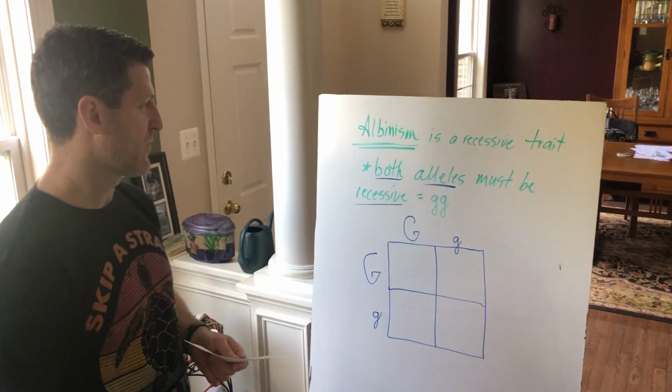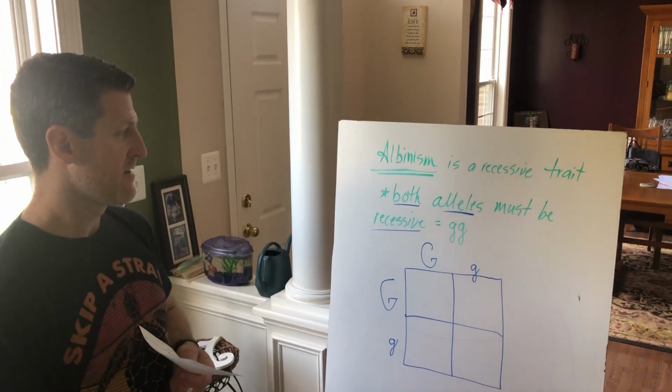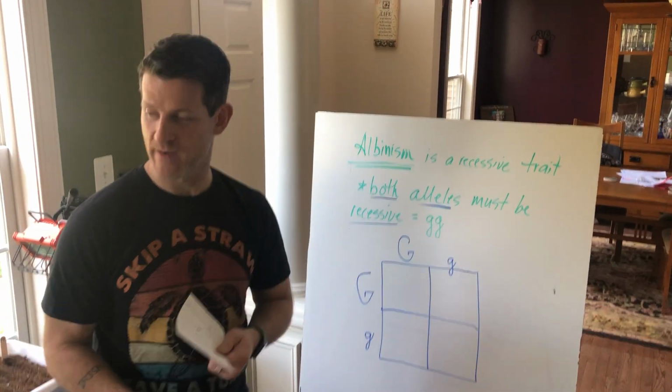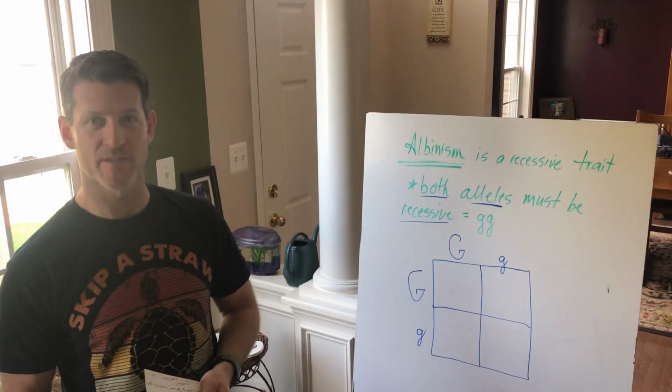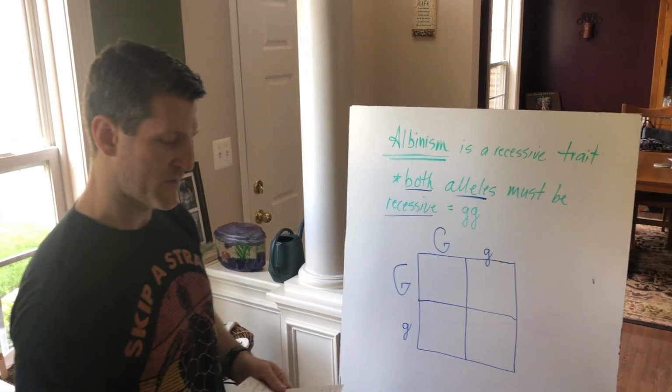Today we are going to get ready to set up our lab for corn inheritance. I got my helper right here, Alex, and my videographer holding the camera is Mrs. McGough. So she'll be helping us out as well.